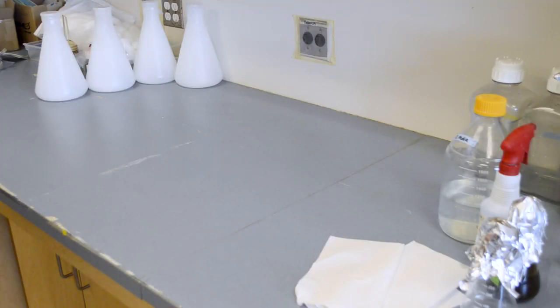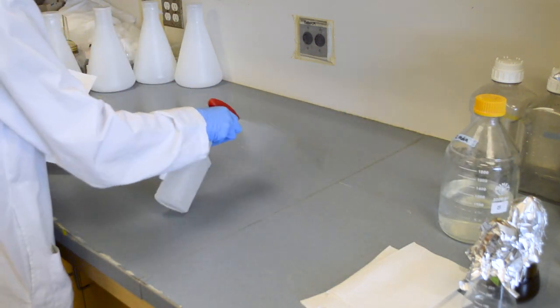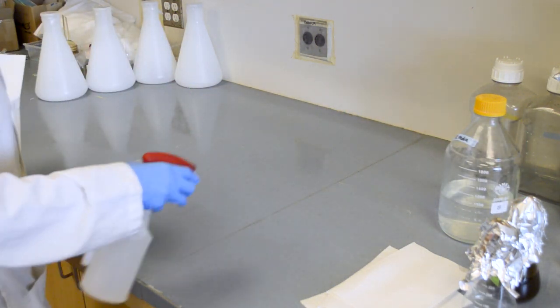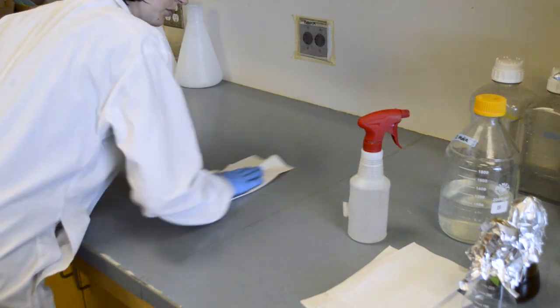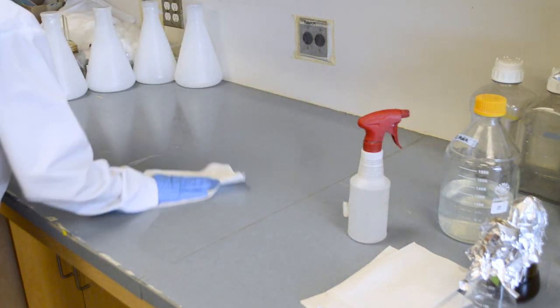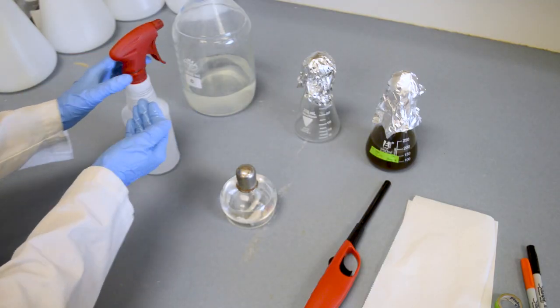First we use the paper towel and alcohol spray to clean our empty workbench and wipe it down. Wipe the bench from back to front so you can clean the areas you were leaning over. You aren't trying to dry the alcohol, but you want to spread it out so that the entire surface is cleaned.